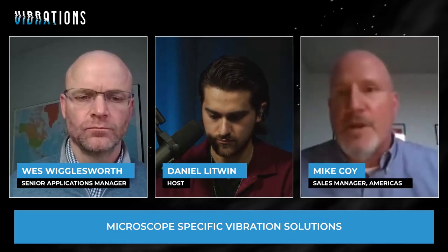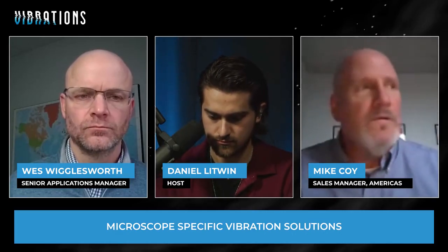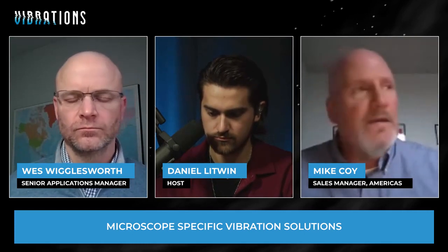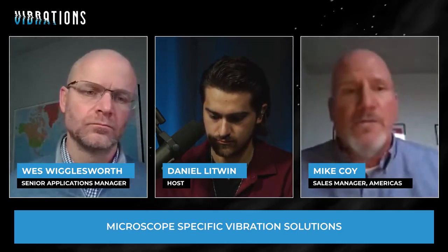And quite often combinations of systems are required to even come close to being stable enough to see what these people are hoping to see. In addition, now we're talking about new eras of things like low dose imaging, where we have new cameras out in the field that are capable of counting individual electrons as they strike a sample.